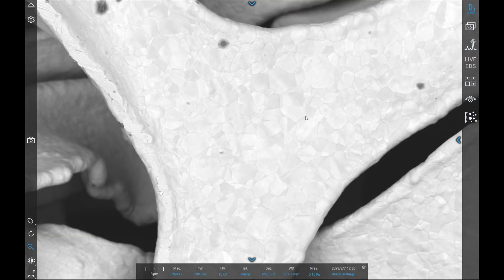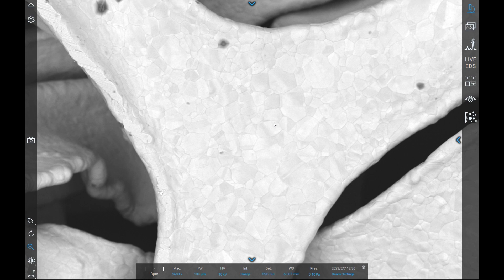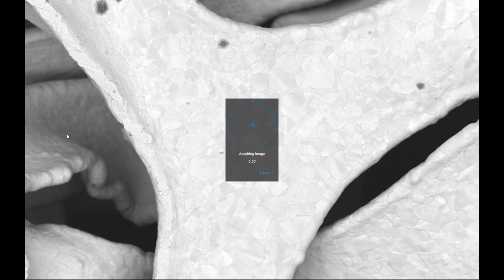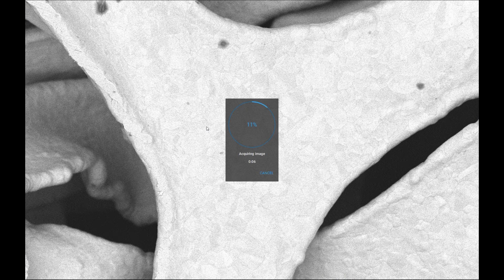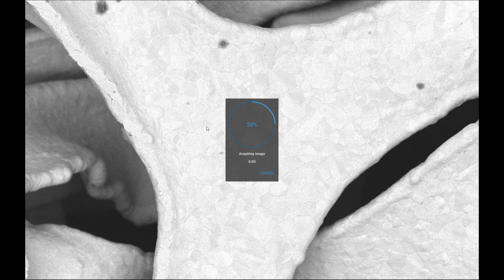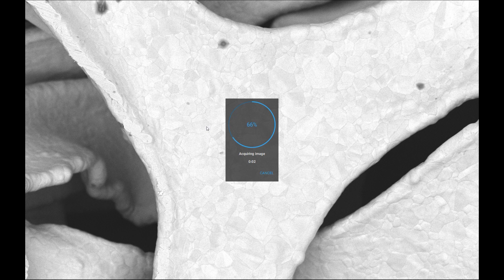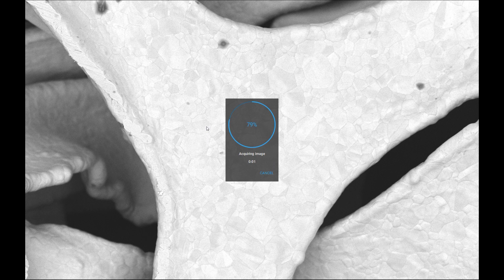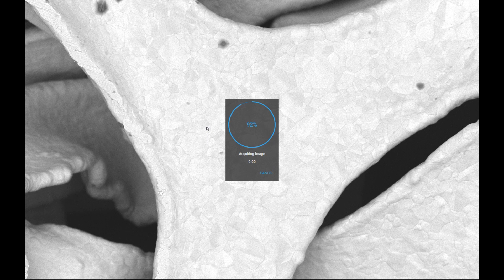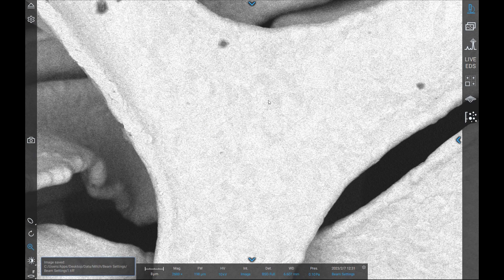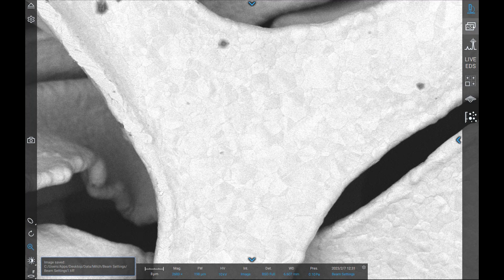A beam intensity of image is great for standard imaging. It is our second lowest beam intensity, but it produces a high amount of signal in images with high resolution. Image intensity is our most commonly used setting for the majority of imaging applications.